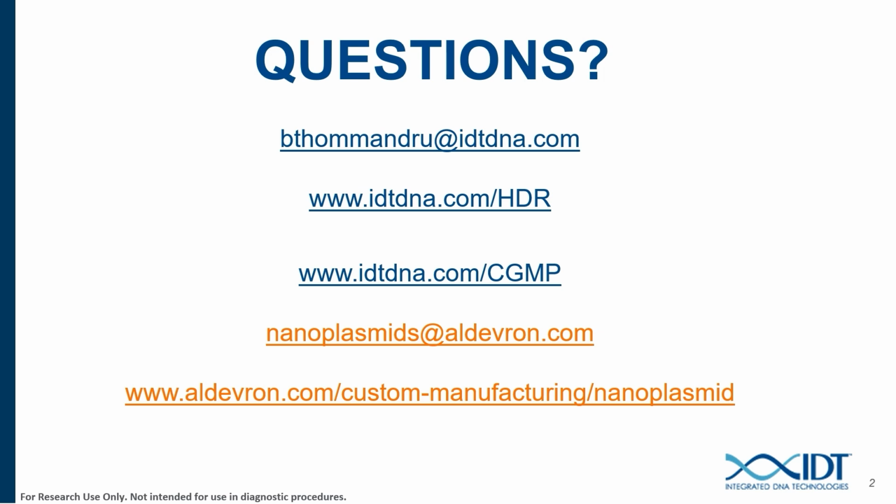Perfect. Some good questions here. Please keep these coming. How much variability is there in editing efficiency between different cell donors? Great question. A lot. There's a lot of difference between different donors, just like every human being is different. It can be due to a number of factors like the chromatin state or any specific SNPs that a person would have. We don't necessarily see differences in trends for different reagents or doses, but generally the baseline and the potential for CRISPR editing is what varies donor to donor.